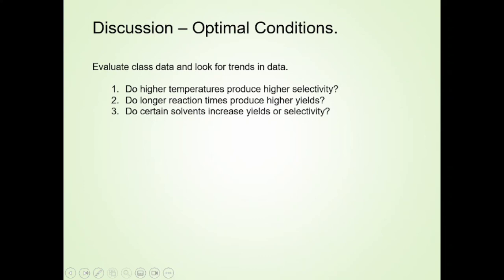And when you're working at that scale, even small improvements in yield can be significant. But the process chemist, in addition to looking at different synthesis, might look at different solvents. Does it work better in a polar solvent, in alcohol, or less polar in ether, or maybe non-polar like hexane? What is the reaction time? If you don't go long enough, of course, you might have low yield.